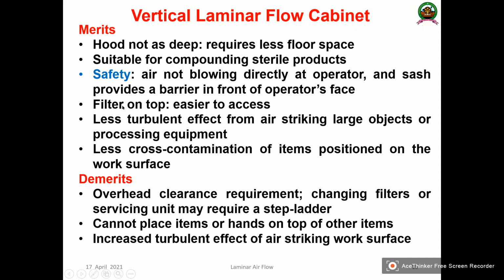Then the filter on the top is easier to access, less turbulent flow from air striking a large object or processing equipment, and less cross contamination of the items positioned on the work surface. These are the major advantages of vertical laminar airflow cabinet.